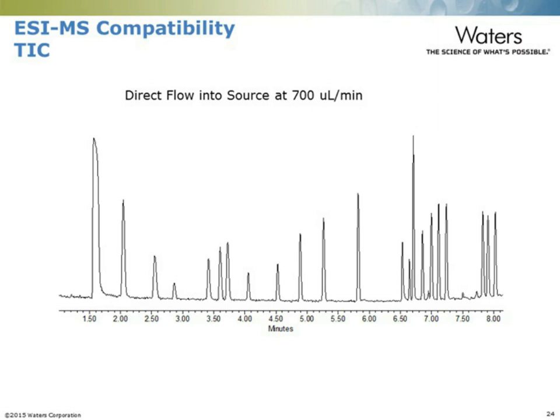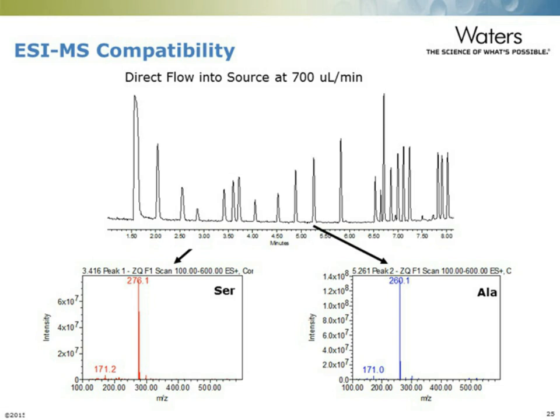With the mobile phase that we've developed, you can do electrospray ionization and get the mass of each peak that corresponds to the mass of the derivatized amino acid. We wouldn't normally use this as a routine detection technique. There is no gain in sensitivity when we go to MS as compared to UV, and the identification of the peaks in most samples is certain from the retention time of the peak.